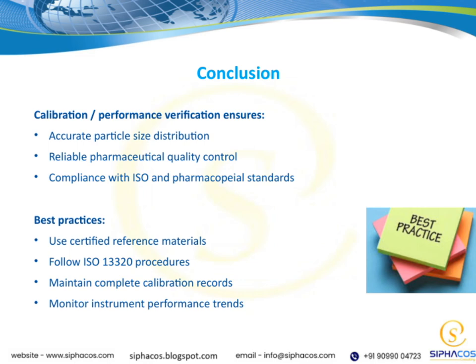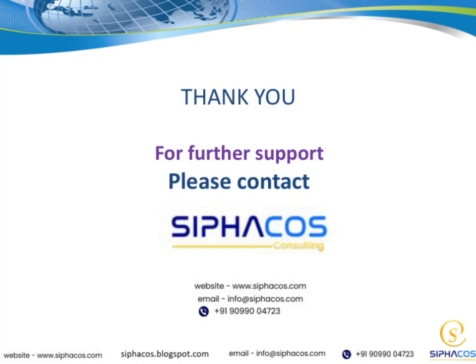Lastly, monitoring instrument performance trends allows us to detect any deviations early, so we can address issues before they affect our results. All these practices together help us maintain the integrity of our measurements and uphold the highest standards in pharmaceutical analysis.